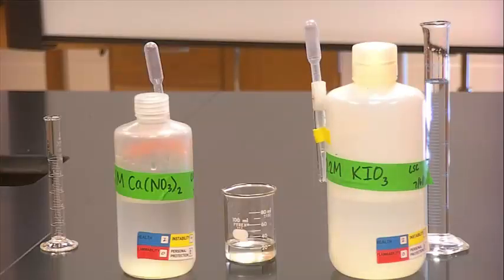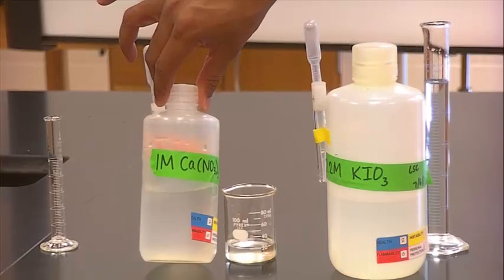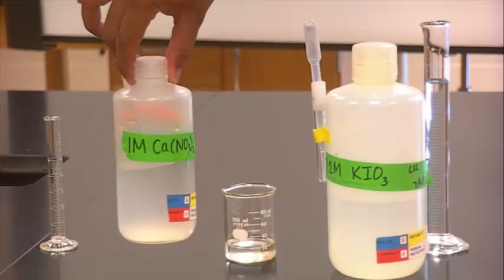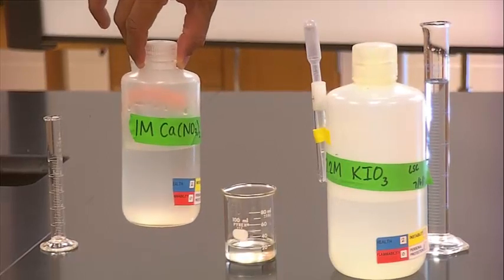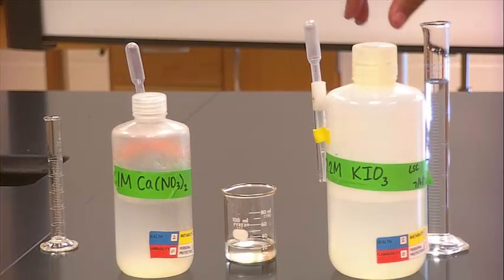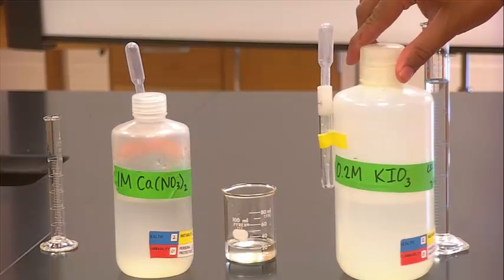You begin by preparing your sparingly soluble precipitate, which is your calcium iodate. To do that, you will mix 20 mL of 1 molar calcium nitrate. Remember, all nitrates are soluble, so it should remain nice in solution, and it is. And you will react that with 50 mL of 0.2 molar potassium iodate.